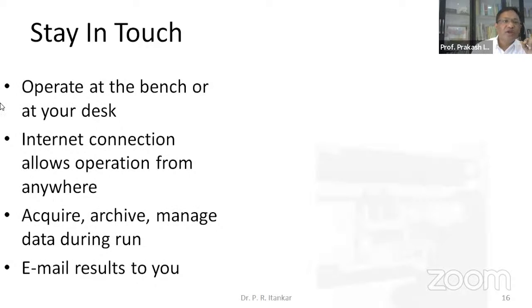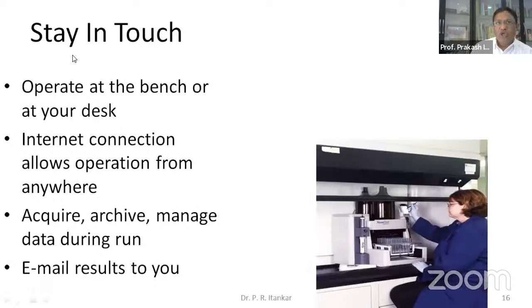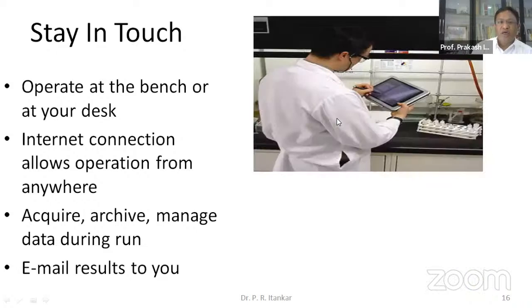So what is really needed is a system wherein I'll remain in touch with the whole process that is going on. I will be updated by the system at my work desk, or I can look at the computer screen to see how the separation is going on. That is possible. Here the whole system is connected through internet, and it helps in acquiring, archiving and managing the data during the run.